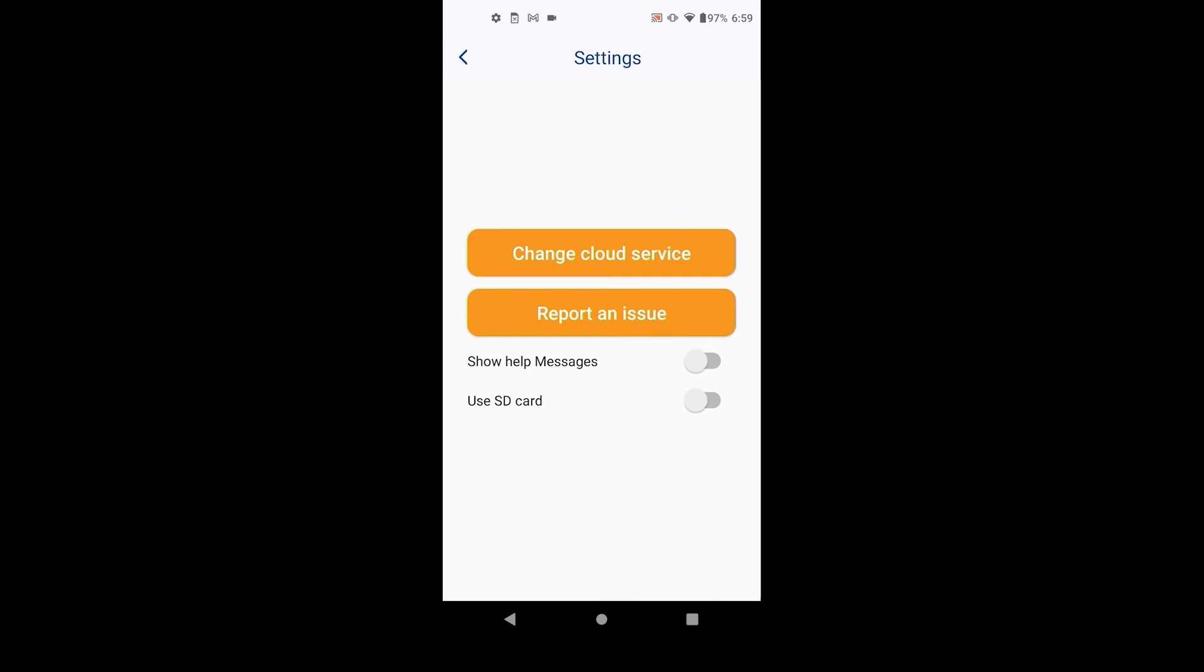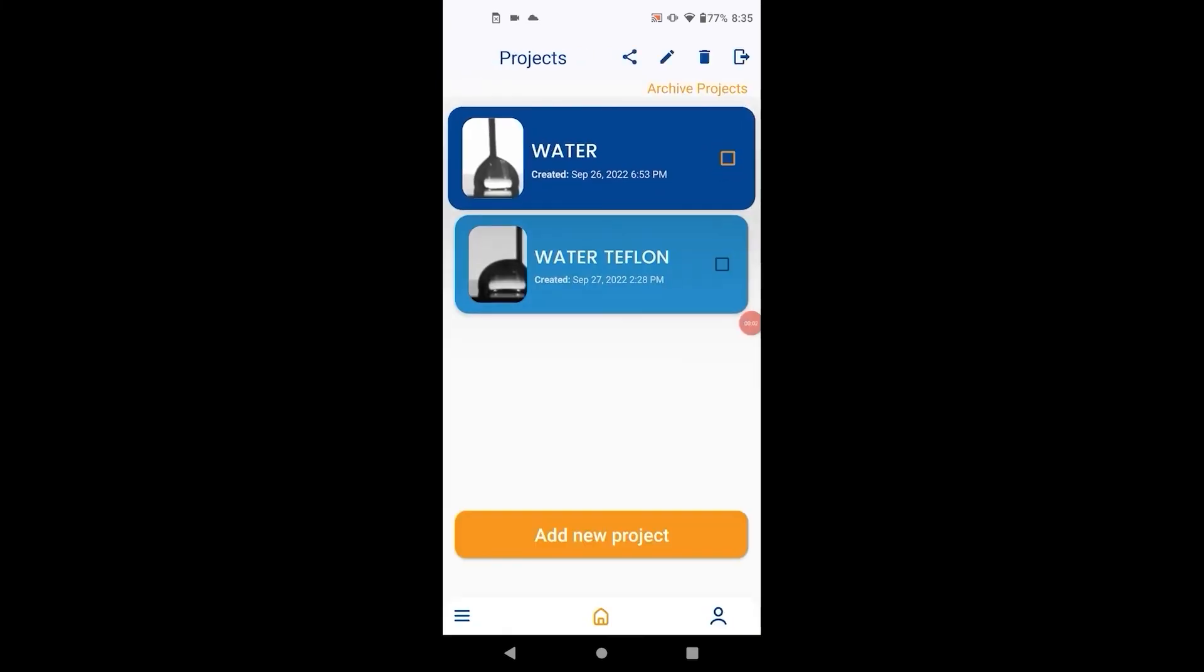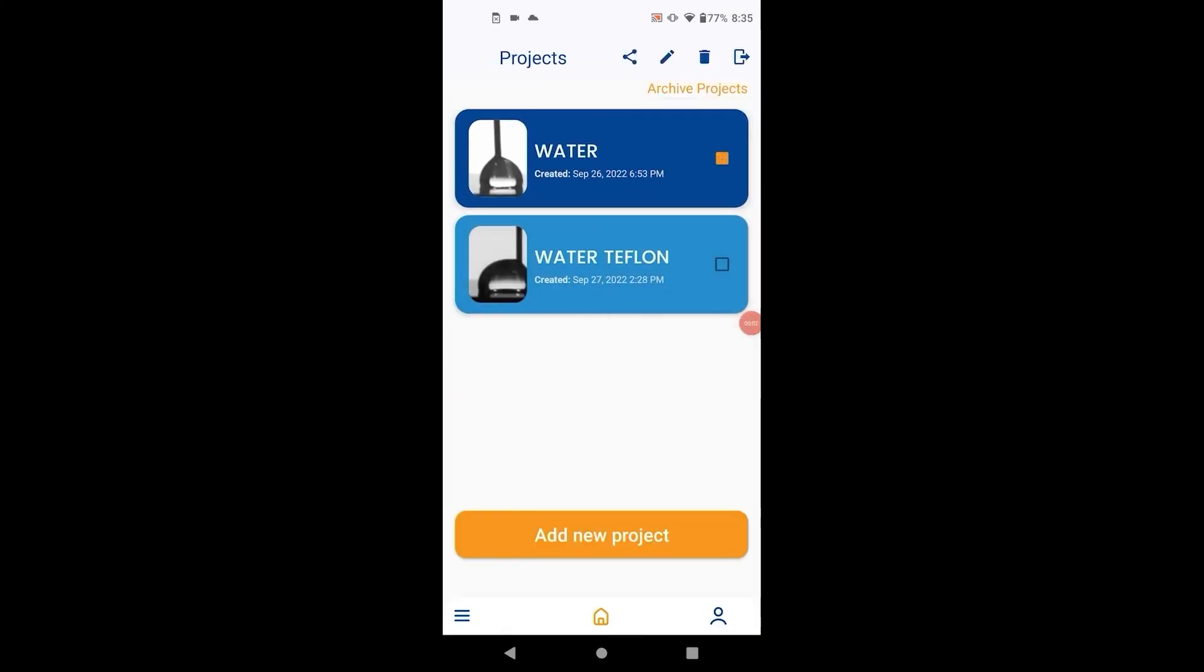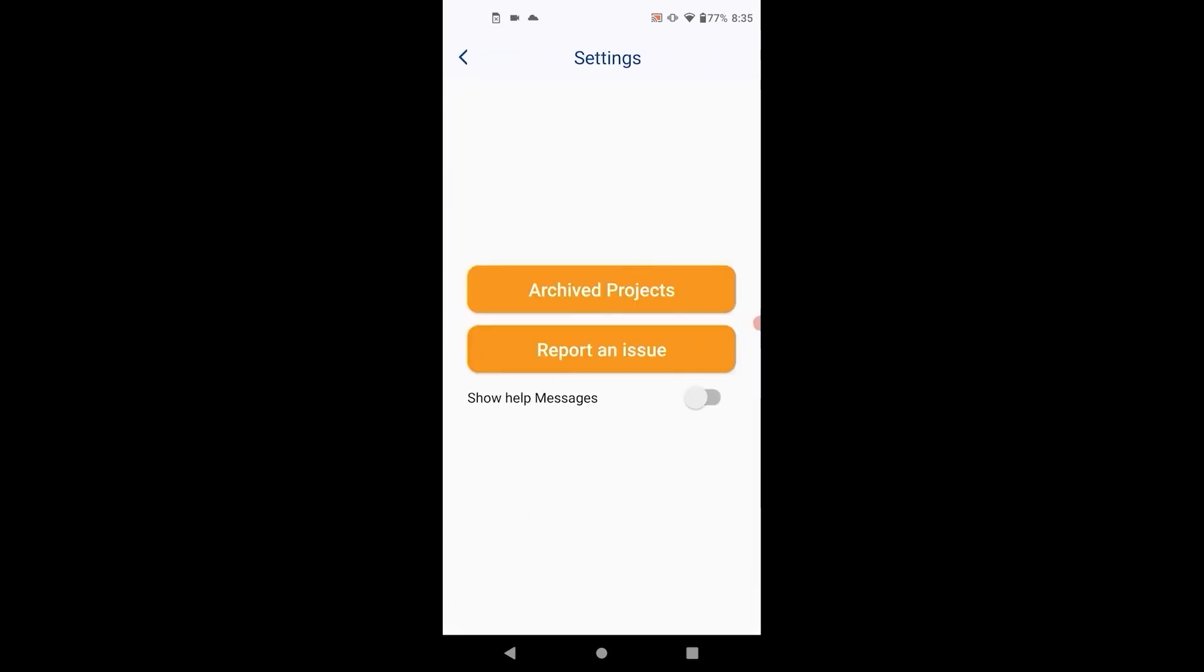We also allow you to easily report an issue from within the app via email. To archive a project, long press the project and hit archive. Archived projects can be accessed from the settings screen.